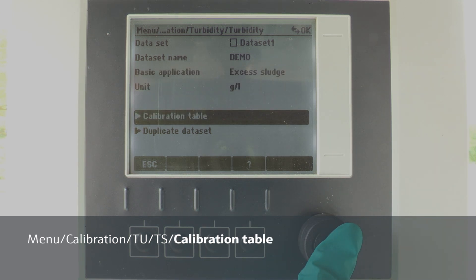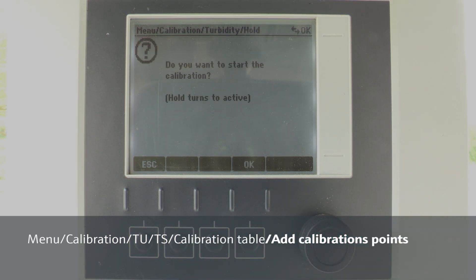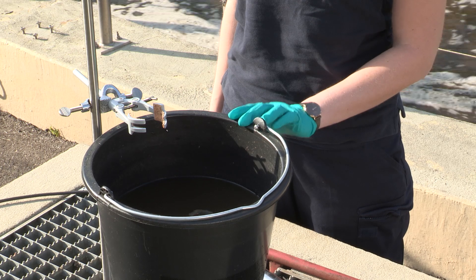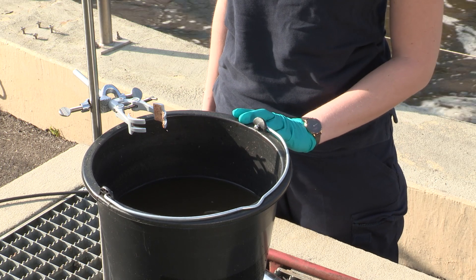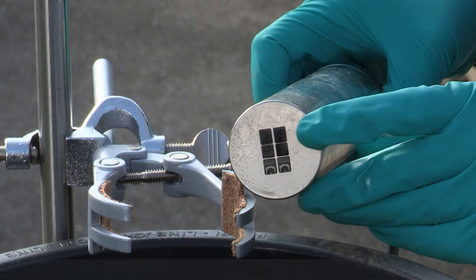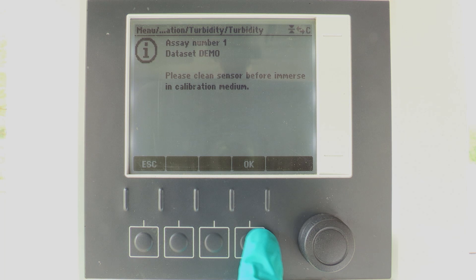Now we enter calibration table and add calibration points. Then confirm with OK to start the calibration. Before confirming the next step, it is very important that the sample is well mixed, so please put it on a stirrer. Then we have to immerse the sensor as follows. Please ensure that the LEDs are directed towards the middle of the bucket — this is very important to prevent air bubbles and to avoid wall effects — before we press OK.